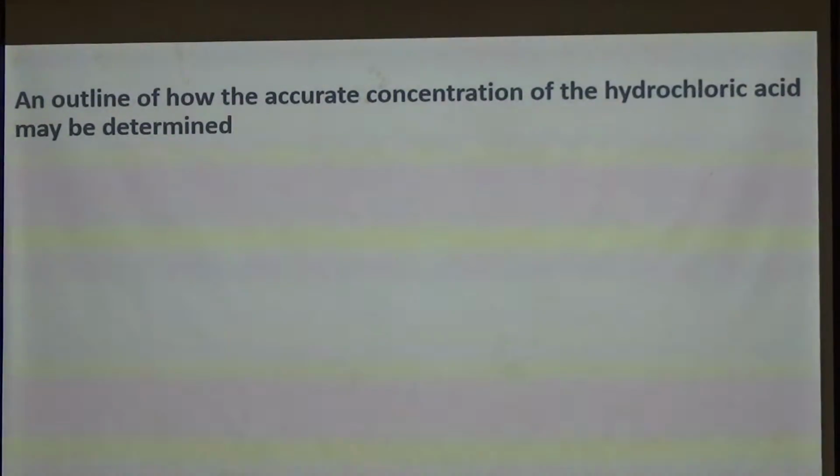But I'm trying to say that in this case, because the ratio is about 1:3 for concentration, and both are monoprotic acids and bases, you don't need to do dilution. You can do a straight titration. But you must choose your apparatus very carefully.